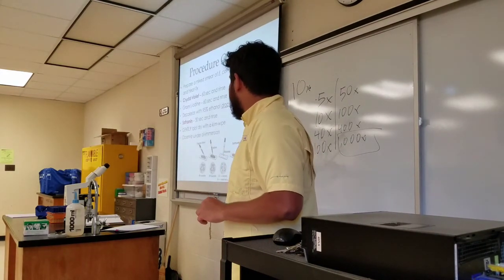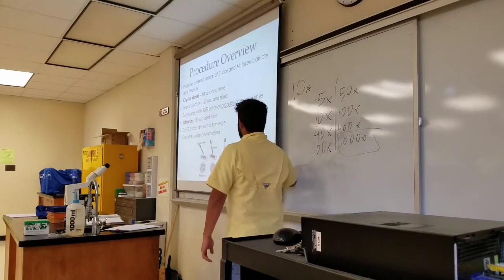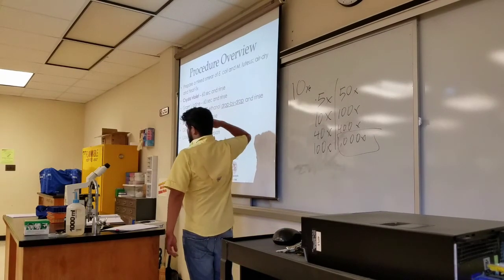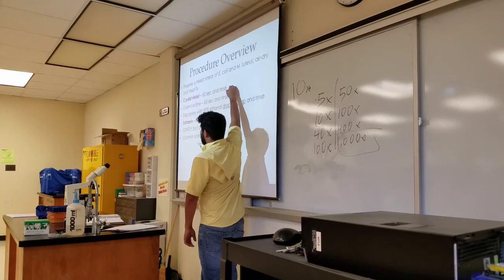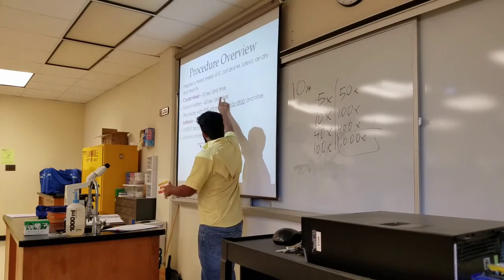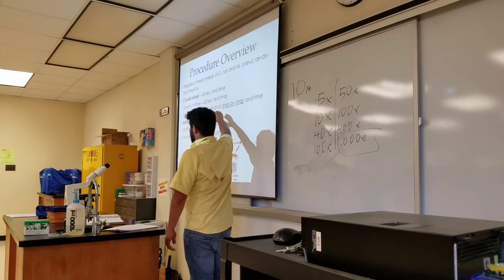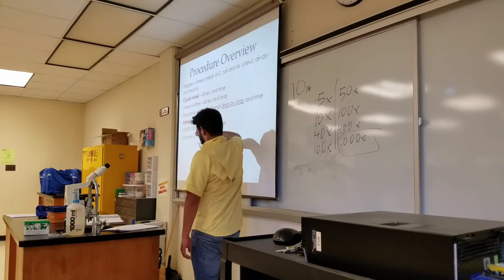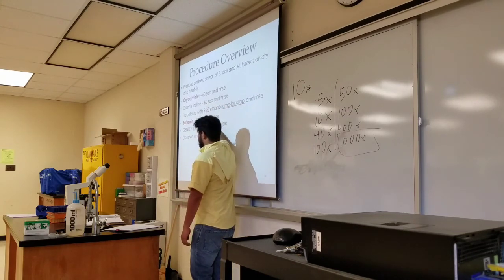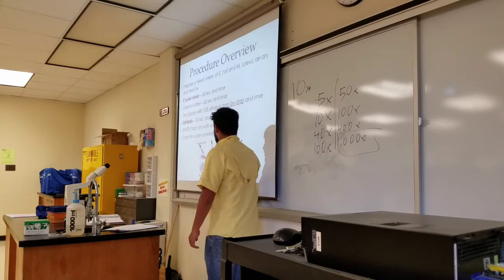This right here is the procedure again, but using times. So times vary within a minute. So this should be a very quick procedure. So crystal violet goes for 60 seconds. We rinse that crystal violet because our bacteria have been heat fixed. That's very important. Gram's iodine, 60 seconds. Let it fix that dye into the cell wall. Then decolorization, drop by drop, until we see clear alcohol. And then we do safranin for 30 seconds. We rinse, and we can observe under the microscope.